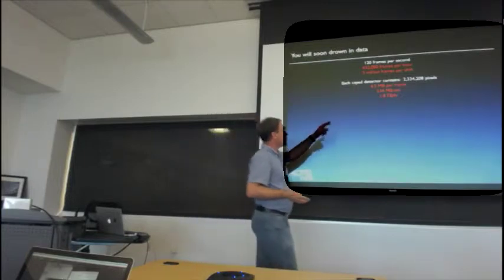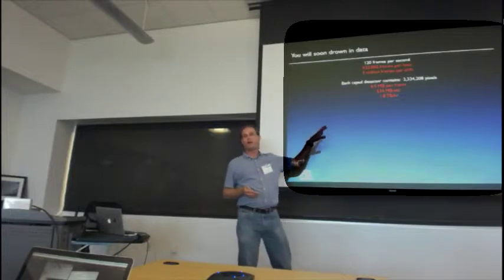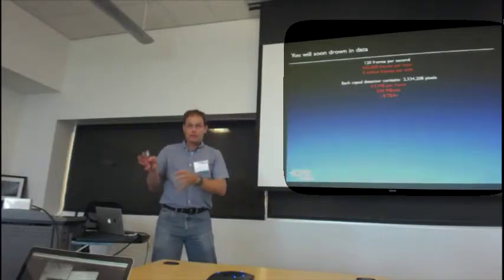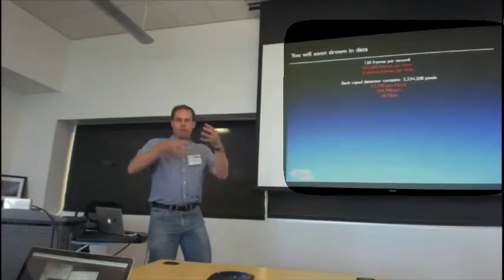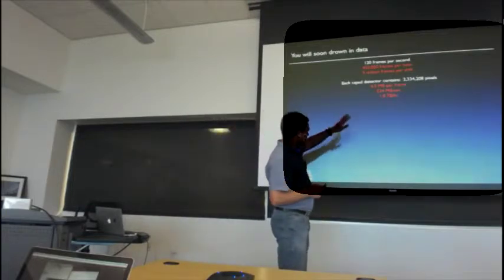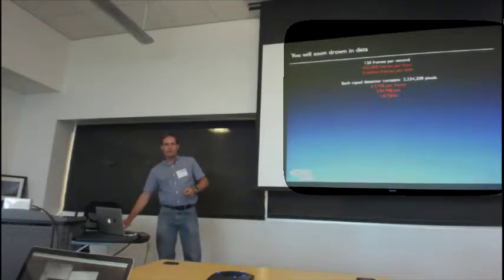So 4.5 megabytes a frame, you've got about half a gigabyte a second going out, or 1.8 terabytes an hour of data that you have to process in real time and move along copying without a glitch, because if you have a glitch or you mush up the data, you're going to totally screw up the analysis.